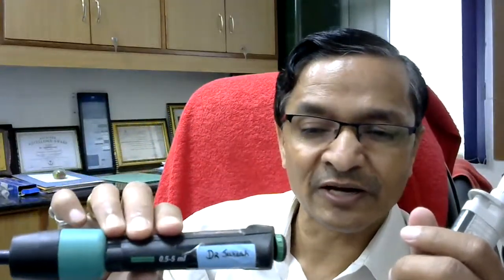This pipette is for 0.5 to 5 ml, so microliter you cannot measure. You have to measure in ml. 1000 microliter is equal to 1 ml. So maybe 0.5 ml or 1 ml, 2.5 ml, 3 ml, up to 5 ml, you can measure roughly.